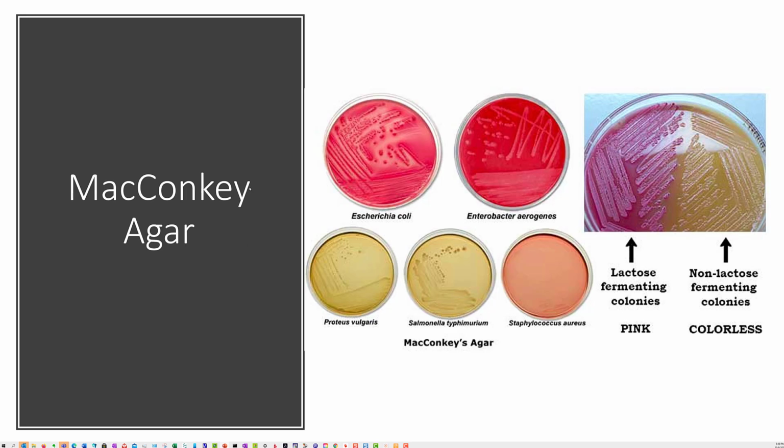Here's my favorite, my MacConkey agar, and what we have is lactose fermenting colonies. You can see the colonies actually turn pink. Now, if it's E. coli, it kind of leaves a sort of halo effect around the colonies. But this is one of the few tests that doesn't really change the media; it changes the colony color. Non-lactose fermenting colonies don't colorize, and they just stay kind of bland and boring.